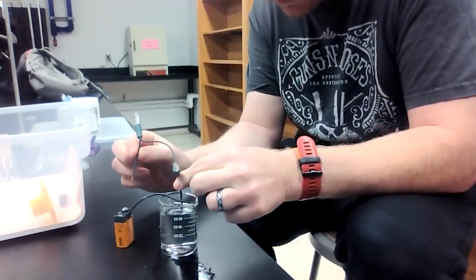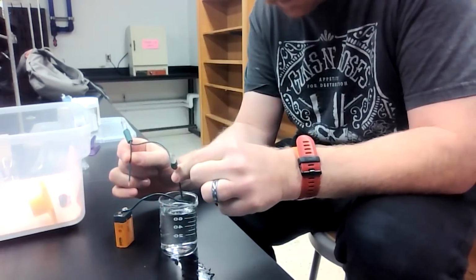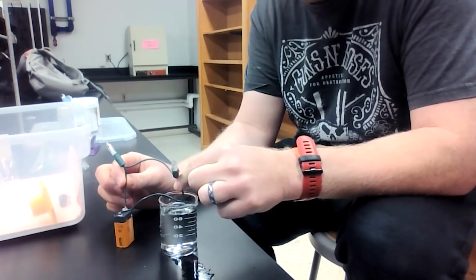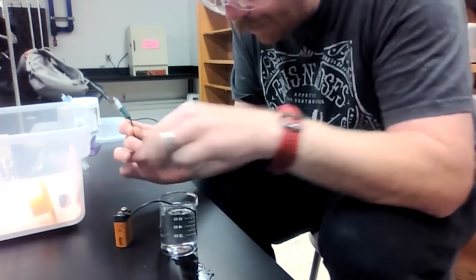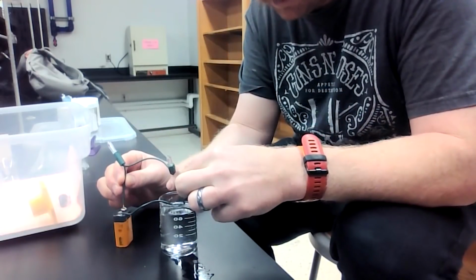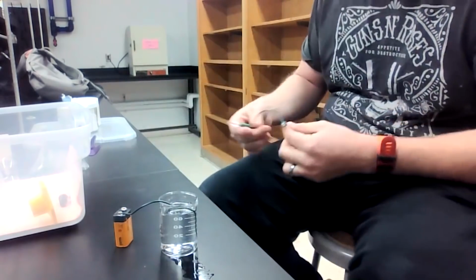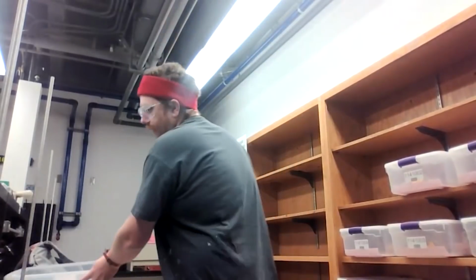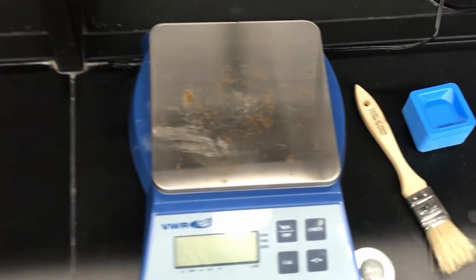Now, my question is, whenever these ends of this wire are in contact with the battery and in contact with the water, will it light up? And you can see that no, it does not. And my connection is fine. This is basically my negative control that indeed ions have to be present in the solution in order for the current to run through.